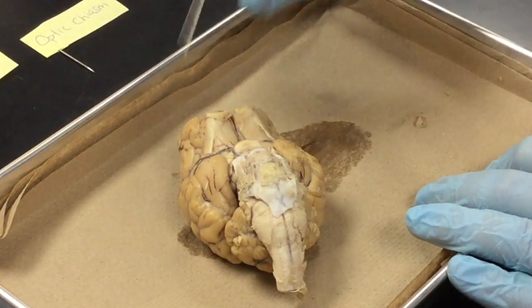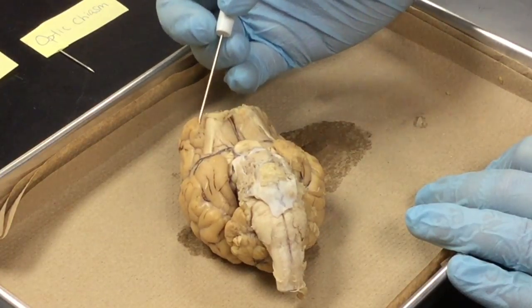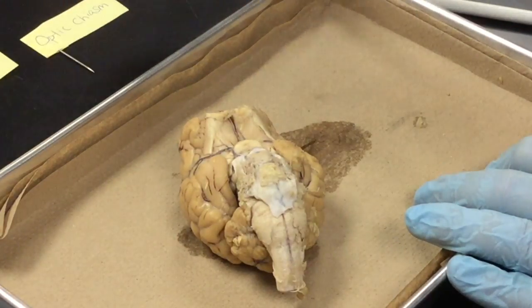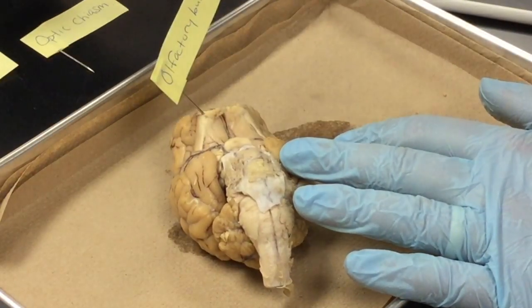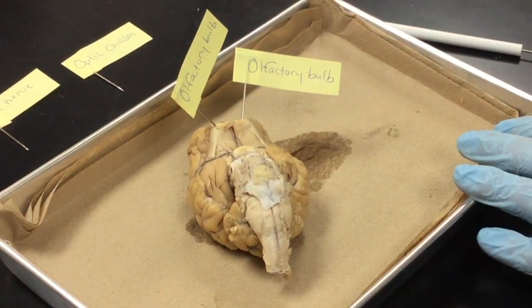Up here at the region of the frontal lobes, the bottom portion, we see these kind of things that look like raised edges that are white. Those are called the olfactory bulbs. So on either side, you have 2 olfactory bulbs.